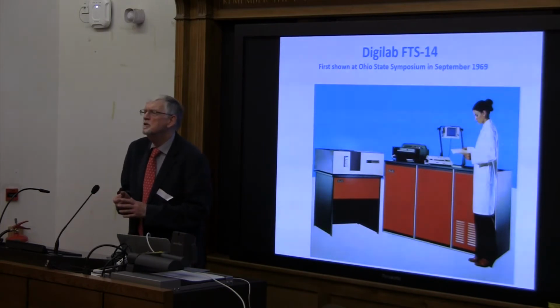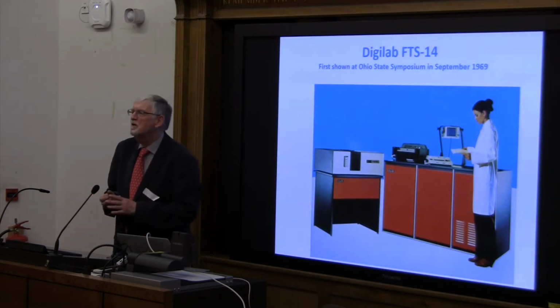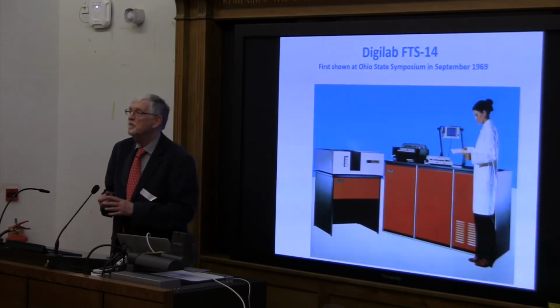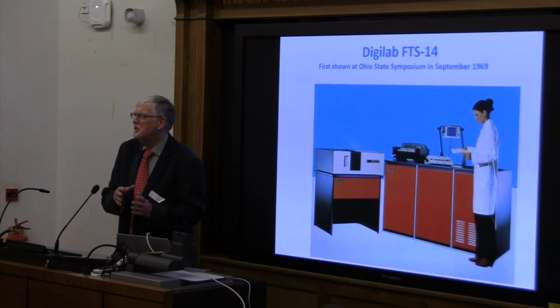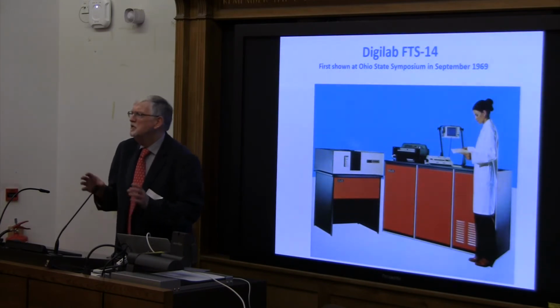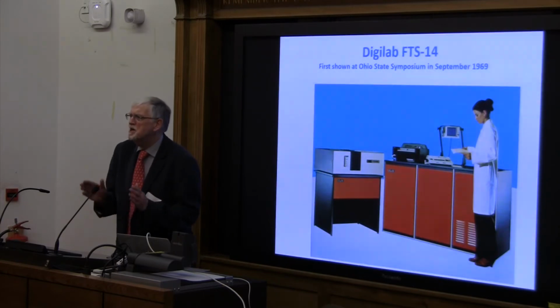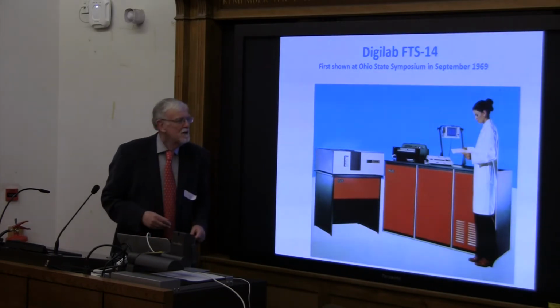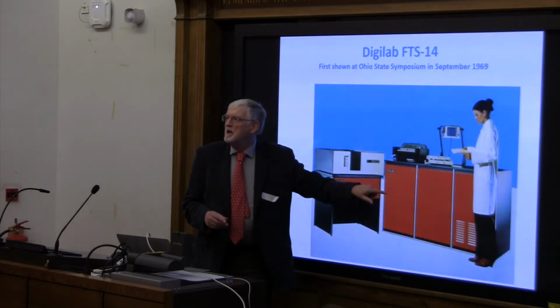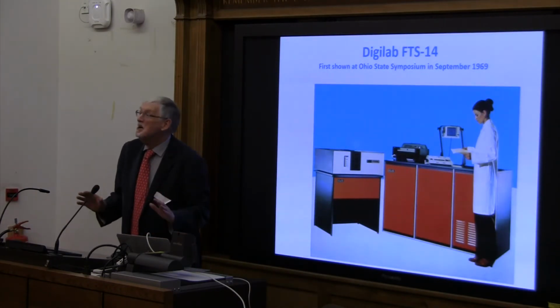Fortunately, we brought along with us a first-year undergraduate, a gopher, if you will, and a very, very bright kid by the name of Bruff Turner. Bruff said, well, department stores are open. Why don't we buy a battery charger? Battery chargers you could purchase at that time were 6 and 12 volts, too high a voltage for the source. So we bought a toaster, and we rewired the toaster to step the 6 volts down to 3.5. When this instrument was shown, sitting in this compartment here, hanging down here, was a toaster and a battery charger. And it worked like a charm.